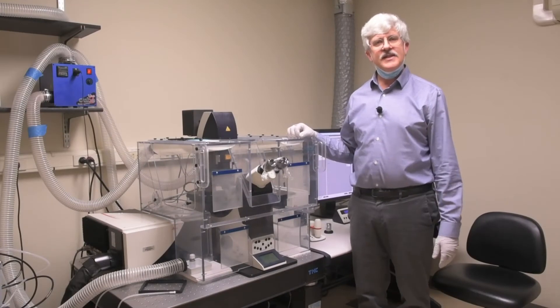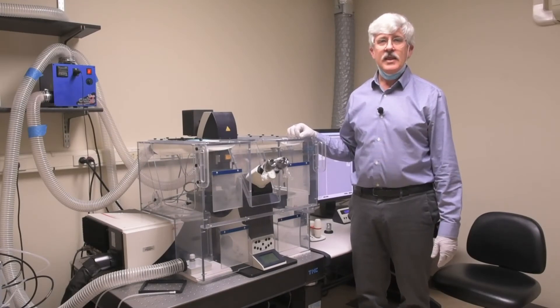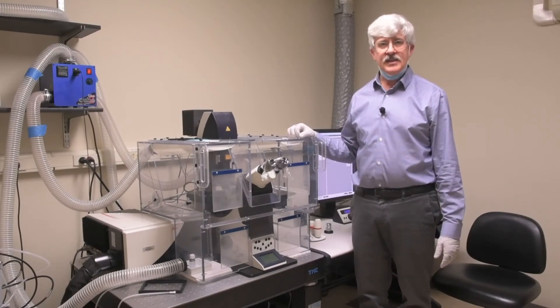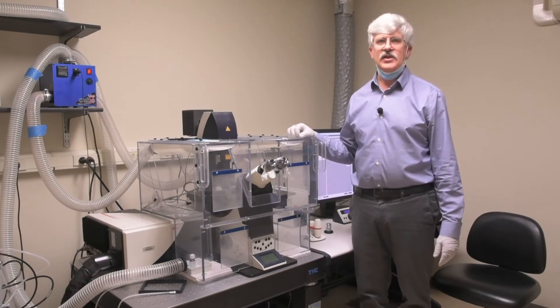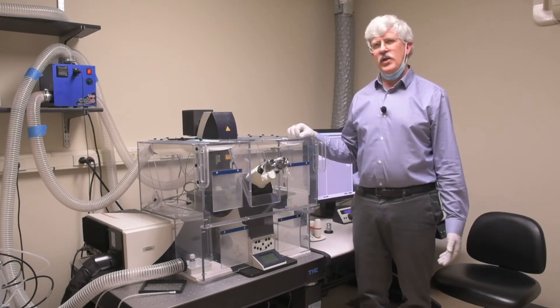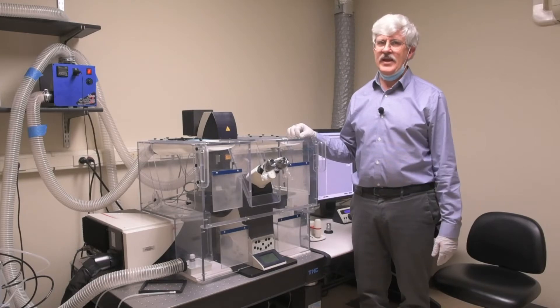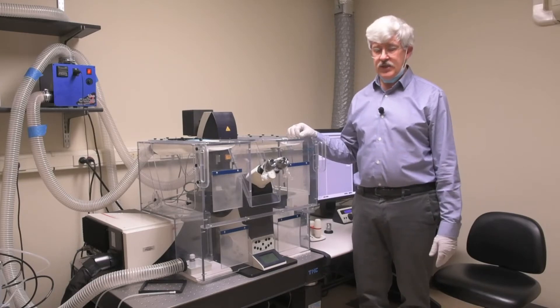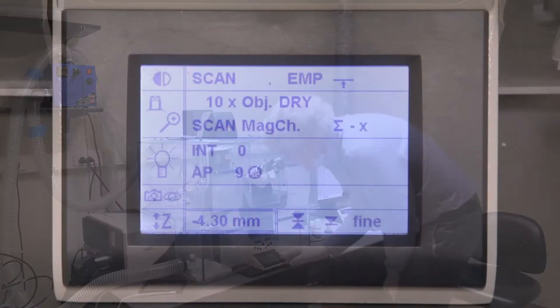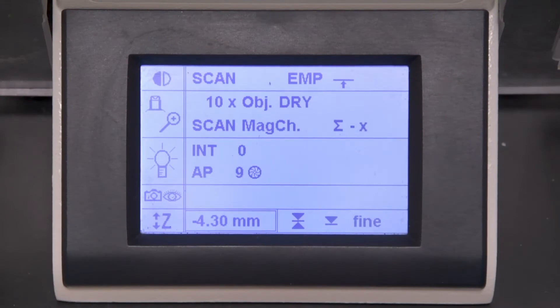First, you'll want to decide which objective to use. The most common one is the 63X, so we'll be using that for this demonstration. But just because that's the one you want to use doesn't mean that's the way it's set up right now, so the first thing to do is check and see what's in there. To see what lens is selected, take a look at the LCD panel on the front of the scope.